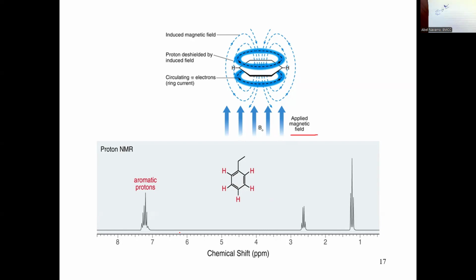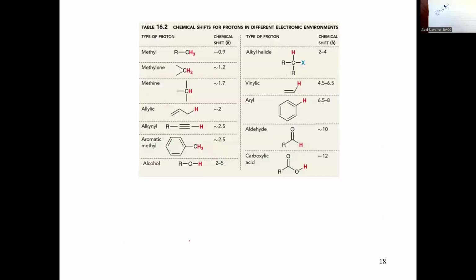So that causes the peaks for the benzene ring, or the aromatic protons, like we call them, to always be between 7 and 8 ppms. They're going to be even more de-shielded or more downfield than the conventional CHs. CHs are on this side, but if you have aromatic it will always be from 7 to 8 ppms. So aromatic or benzene rings will always have peaks between 7 and 8 ppms. Good. That's the reference table. That's the one that is very similar to the ones that you guys are getting.